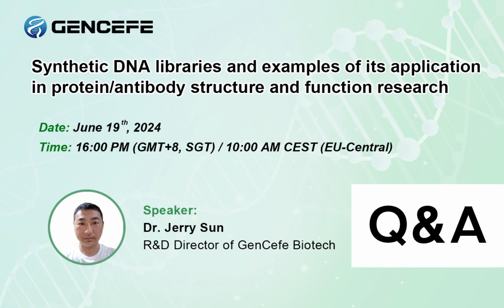But recently there are also techniques that design the antibody in silico. In this case, you don't need the wild type antibody. You can just design from zero, and then do a large scale screening. That's also a process. So do you provide the naive library also? Is that right, if I'm not wrong?